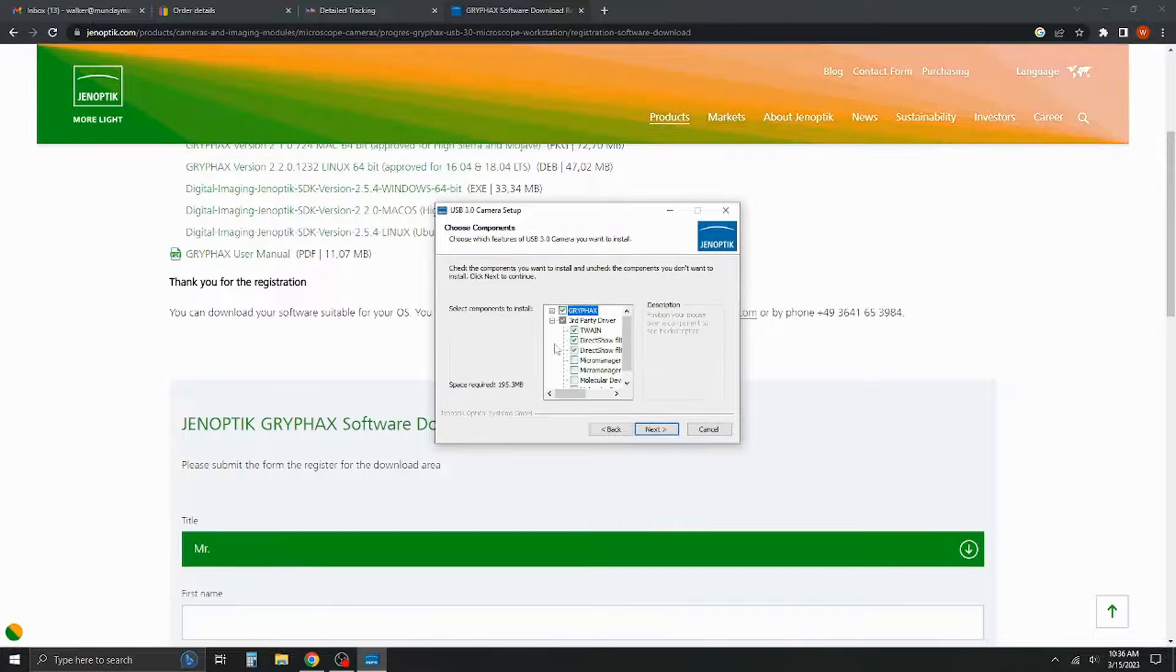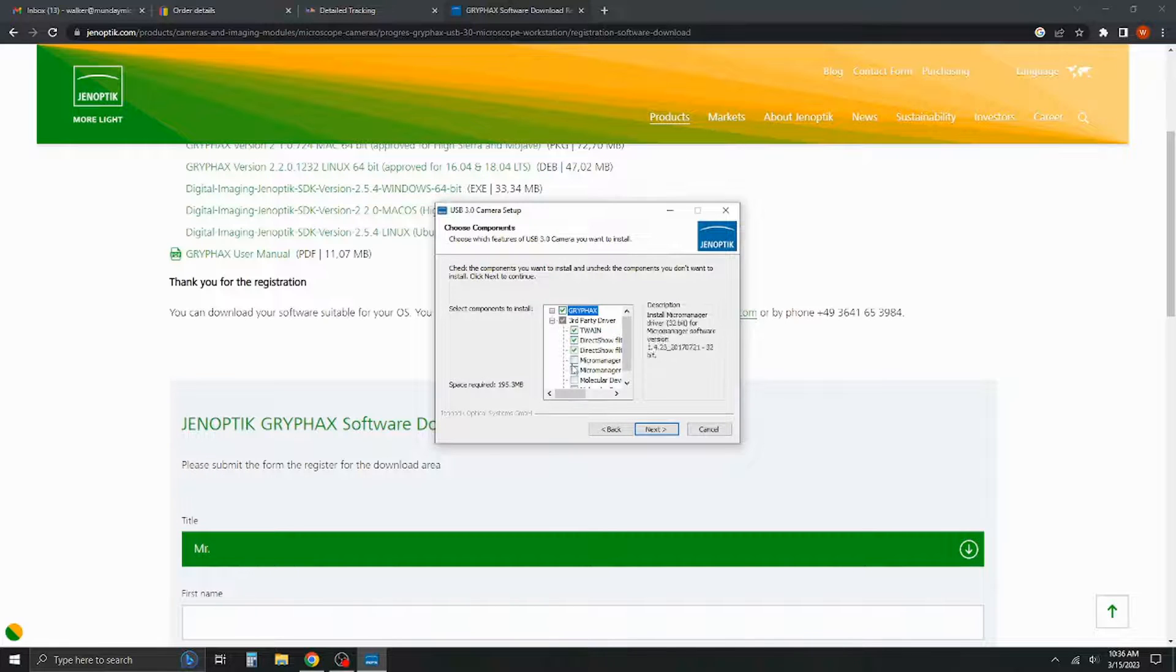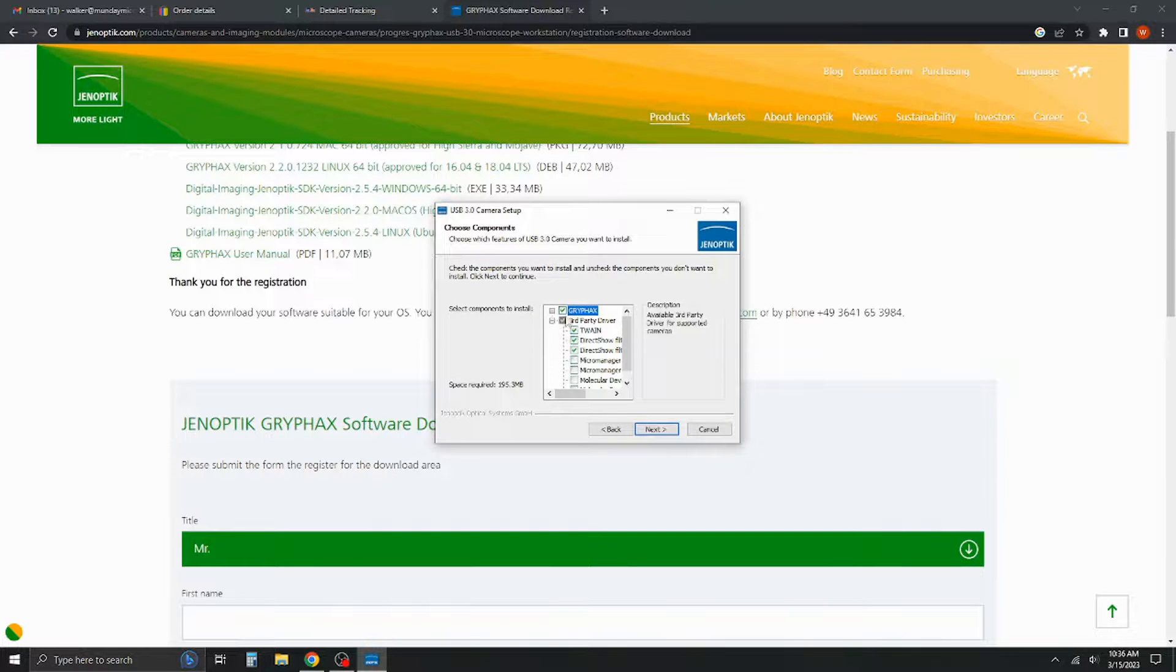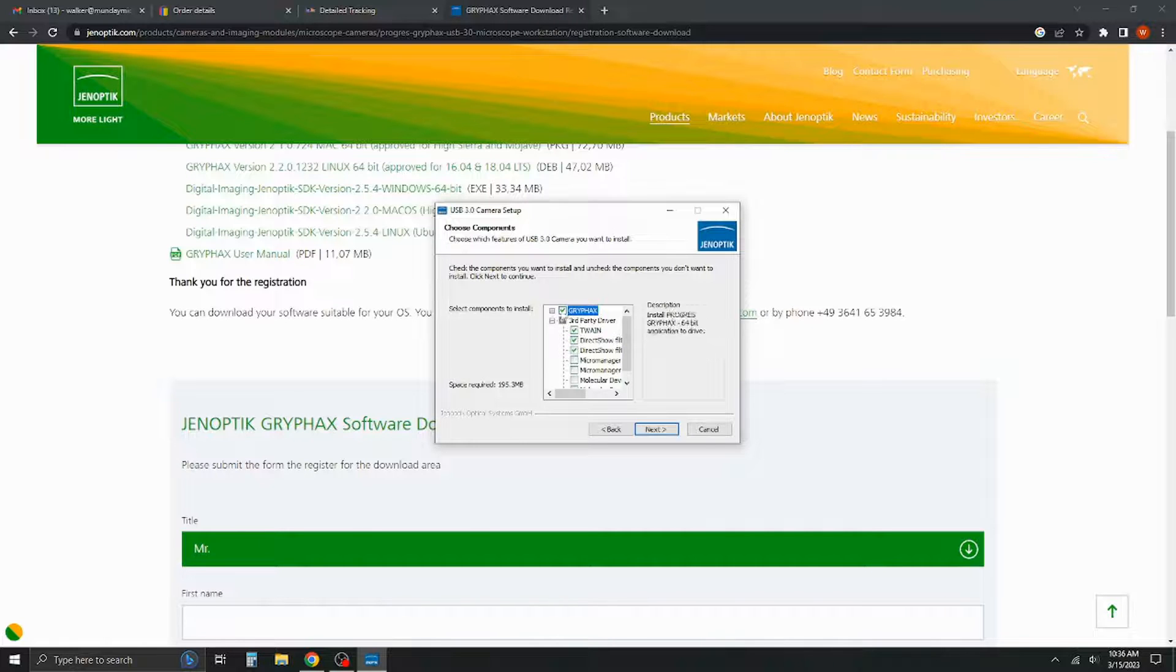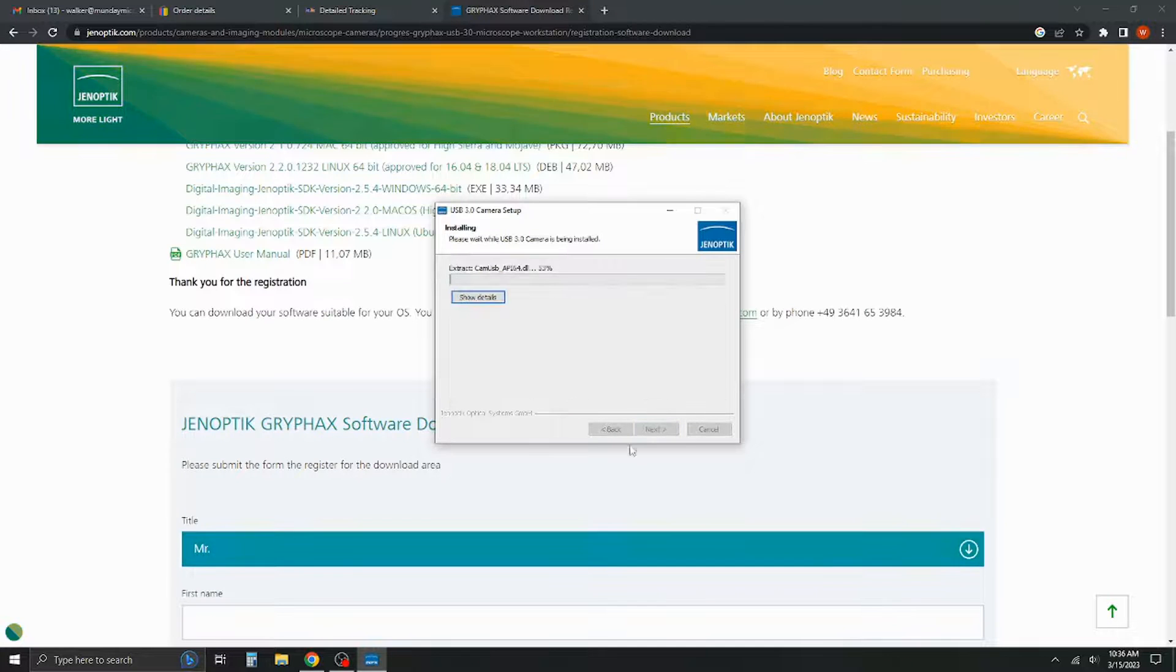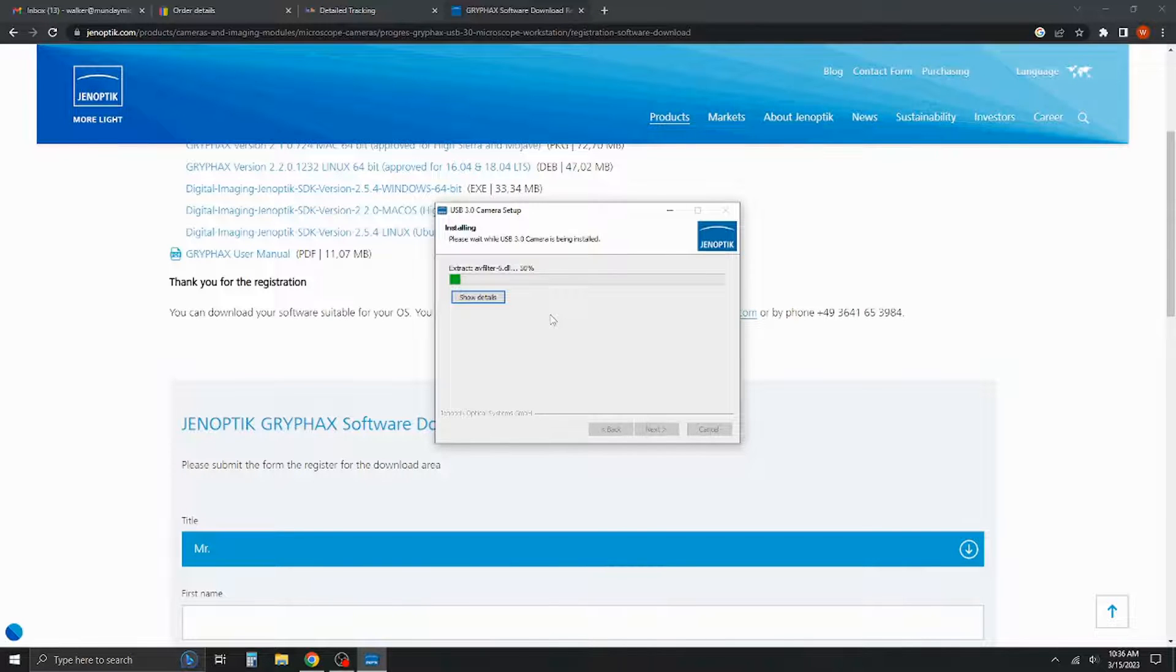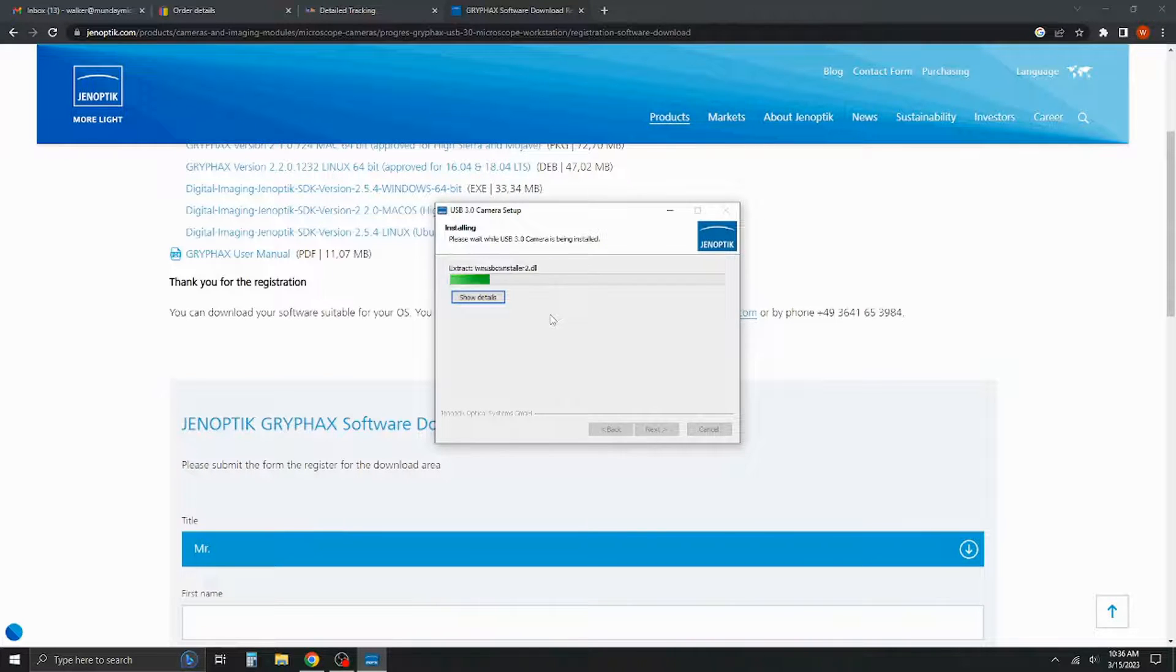Hit next. Now it's going to go through and it's going to set up some drivers it needs to install, as well as some secondary components that it likes to have involved. Again, I tend to leave these just as default. And now it's going to go through and it's going to extract everything it needs and get it set up.